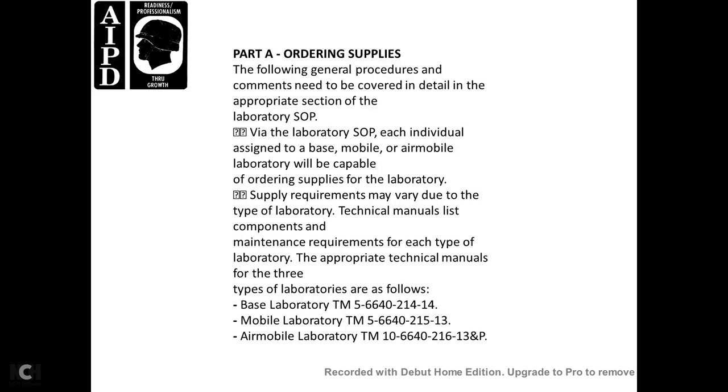Part A, ordering supplies. General order procedures and comments needed to cover the detailed appropriate section of the Laboratory Standard Operating Procedure. View the Laboratory Standard Operating Procedure. Each individual assigned to a base, mobile, or air mobile laboratory will be capable of ordering supplies for the laboratory. Supply requirements may vary due to the type of laboratory, technical manual listed components, and maintenance requirements for each type of laboratory.